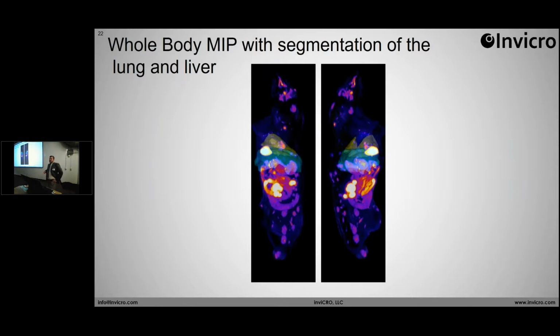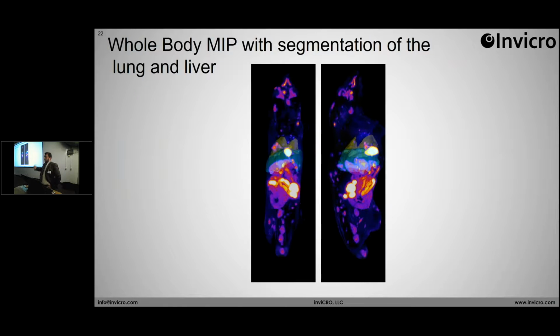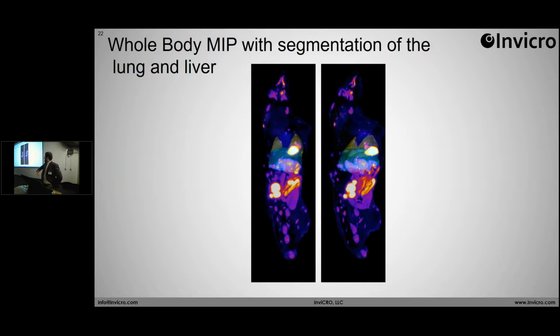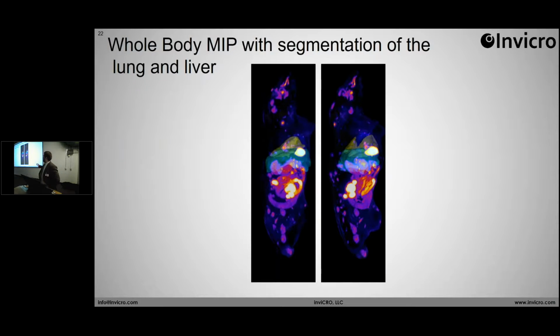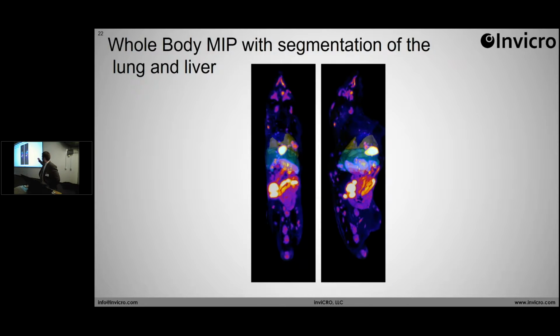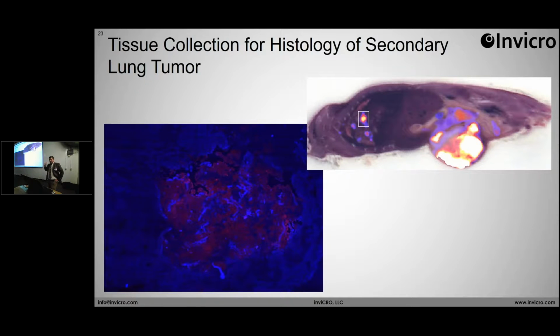And again, we have a lot of established workflows that perform image segmentation on whole rodent bodies. So we can bring that into the fold as well. What we're looking at here is, it's a little bit hard to see on this particular projector, but lungs, heart, and liver as well. And this was, I think, a flank xenograft that threw tumor mets into the body. This one, again, we can tape transfer a piece and then take a look at a microscope.